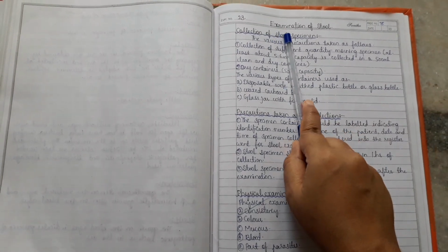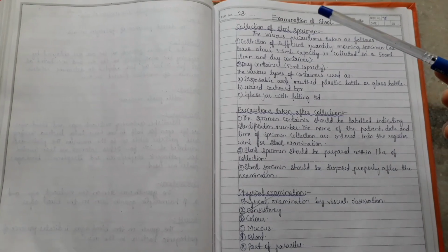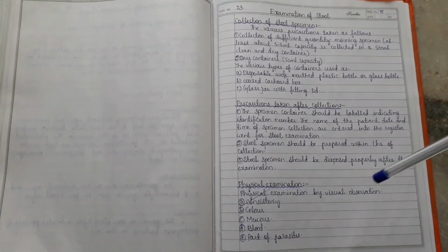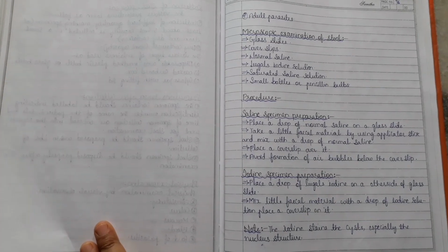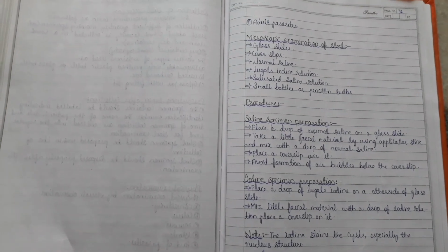So coming to the examination of stool. This is the collection of stool specimen, and the precautions taken after collection. So what are the physical examinations we do? Microscopic examination of stool, what is the procedure? So saline specimen preparation and iodine specimen preparation.